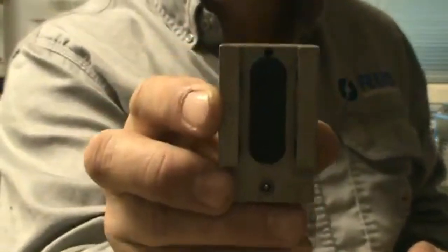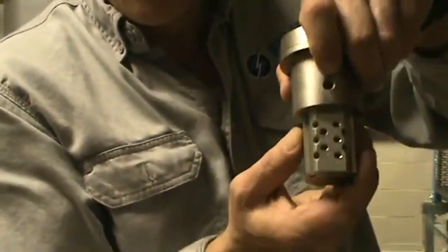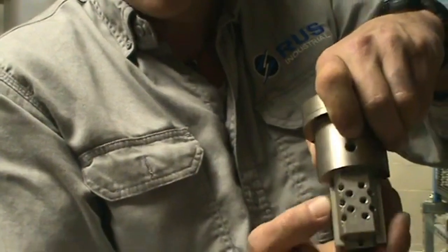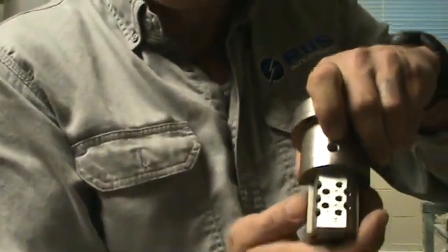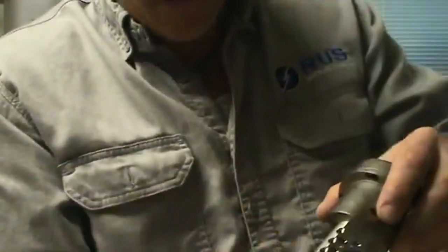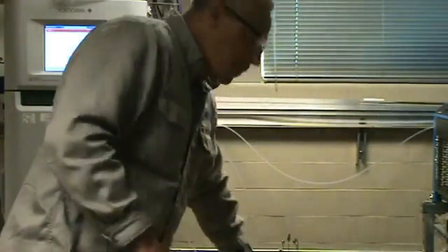Those cuts slide and connect one set of holes to the other. It's a slider valve. That is ABB's genius way of making our sample go where it wants.